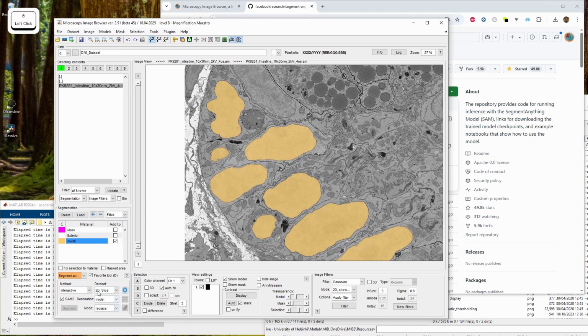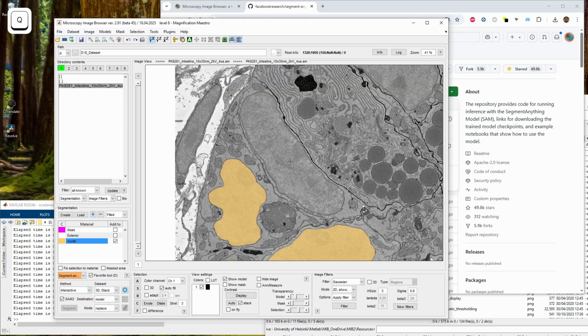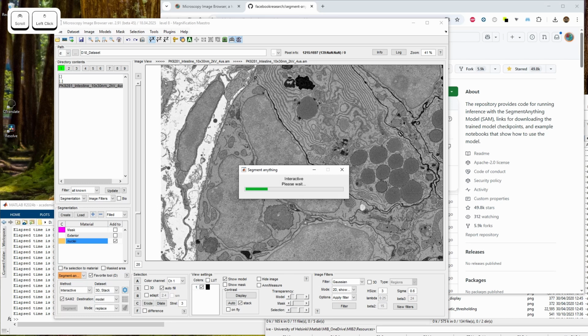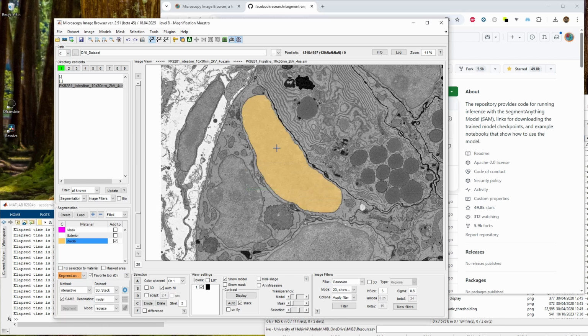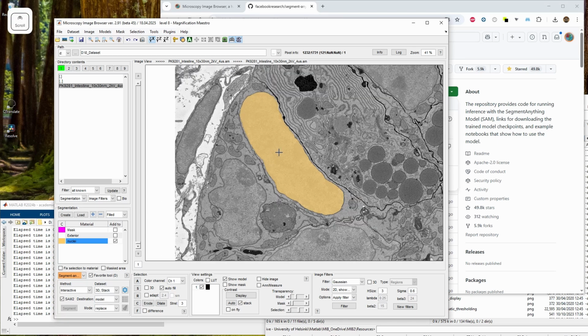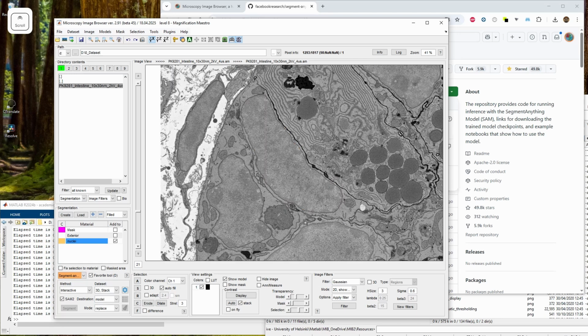Okay, so let's see another mode, which is actually here, but I do not really recommend it that much: the 3D mode. The idea is that you go to an object, you click on this, then I need a little bit of shift here, then I scroll and hold and press shift click. What it actually does is make this kind of 3D segmentation. The point where I click gets interpolated through the volume, and then it will provide the seeds, and the seeds will be used in order to get this segmentation.